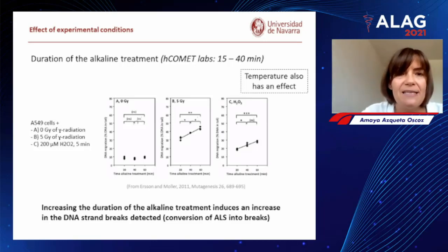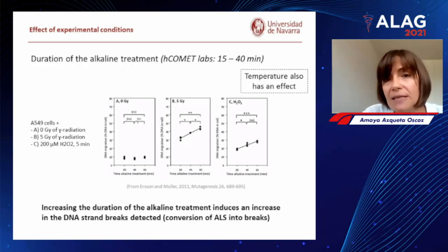The temperature also has an effect in the alkaline treatment. Normally, the alkaline treatment is performed at 4 degrees, but some people use 10 degrees or even room temperature. And the temperature used has a great effect also.